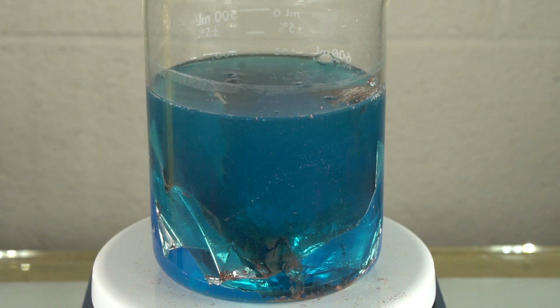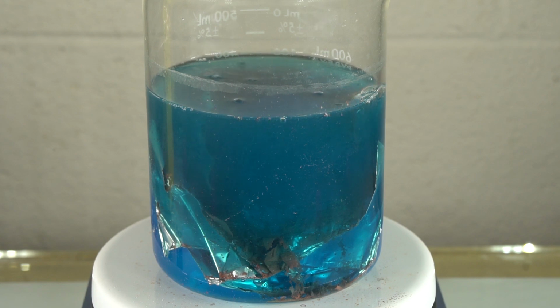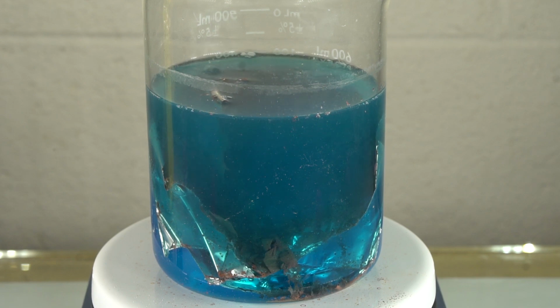So you can already see the copper forming on a lot of the aluminum foil, and eventually all the aluminum is going to be converted to copper. Actually, we put in a slight excess of aluminum, so there should be a tiny bit of aluminum left. But this should be just enough aluminum to react with all the copper in the solution. Again, every aluminum atom is transferring 3 electrons over to the copper, and the copper is being converted to copper metal. So we're going to wait a little bit until this reaction goes to completion, and then we will take a look at our copper metal and filter it and see what we end up with.